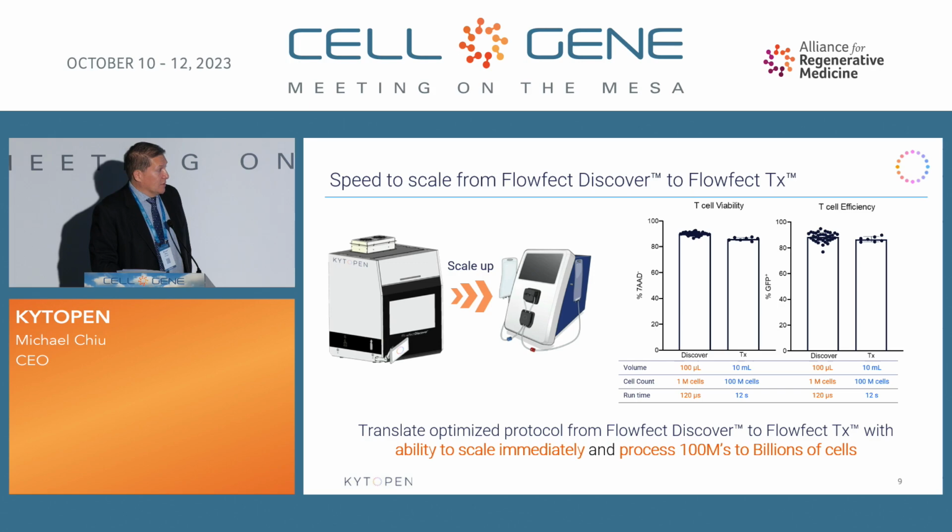The only difference between these 2 data sets is that the left-hand column was run for 120 microseconds. The right-hand column was run for 12 seconds. We produced order of magnitude, or several orders of magnitude more transfected cells. So you can imagine, for getting through clinic, you can run a clinical scale quite easily for allogeneic therapies.